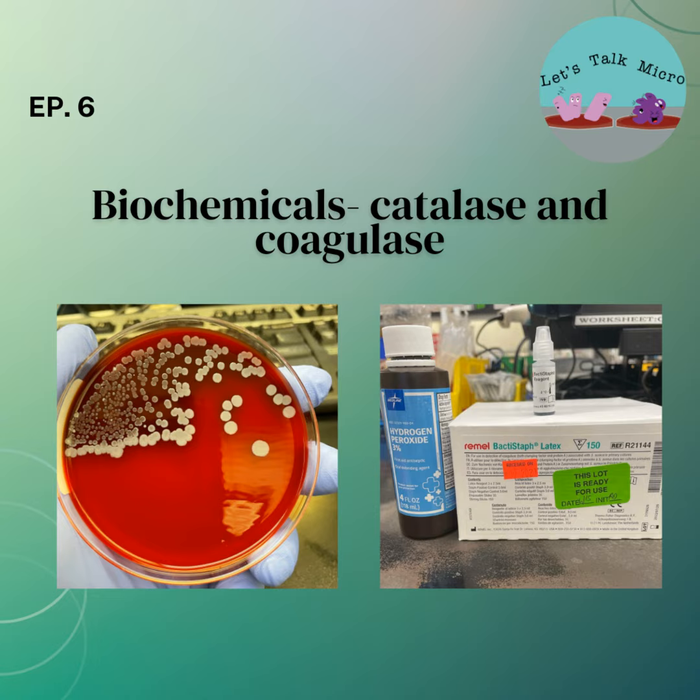So when you have these scenarios, beta hemolytic CNS, or white colonies, urine bench, young female, go ahead and do an ID by another method like the Vitek, MALDI, MicroScan, whatever you use in your lab, because you need to rule out Staphylococcus saprophyticus, which causes UTIs in young females. So there you have it.